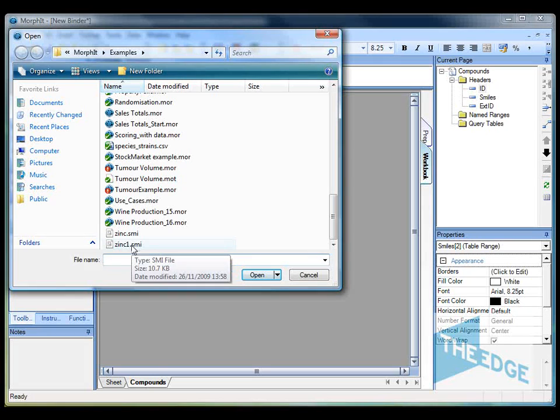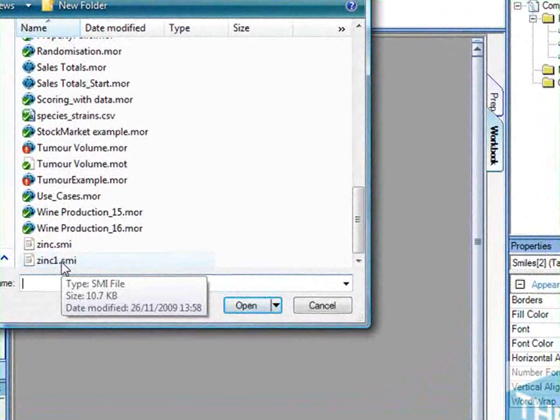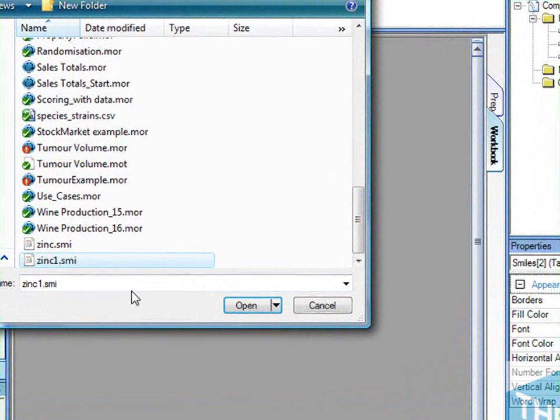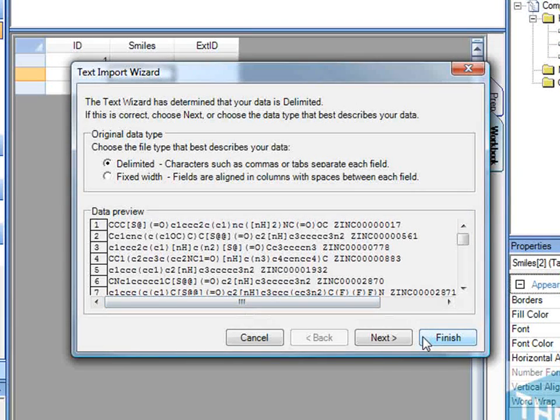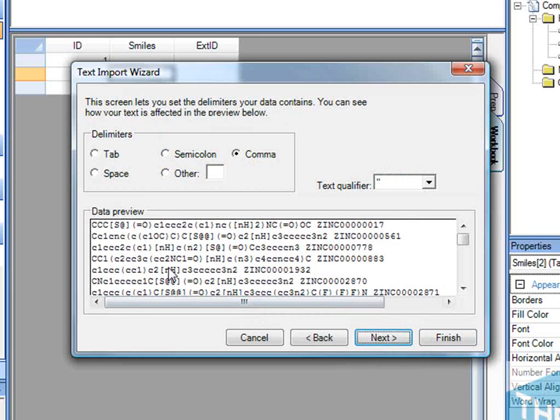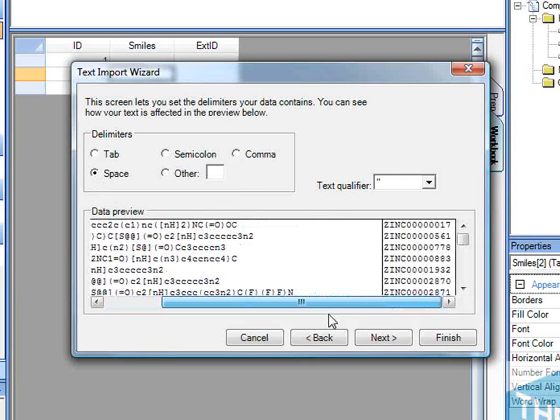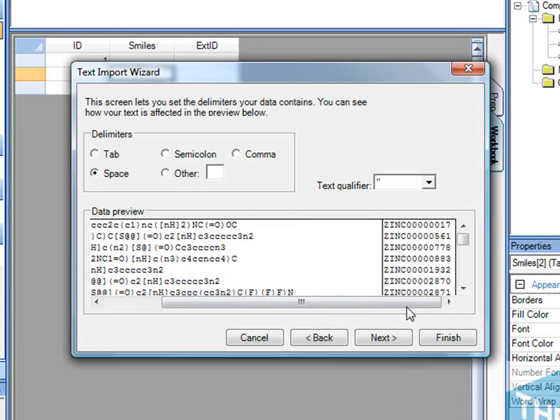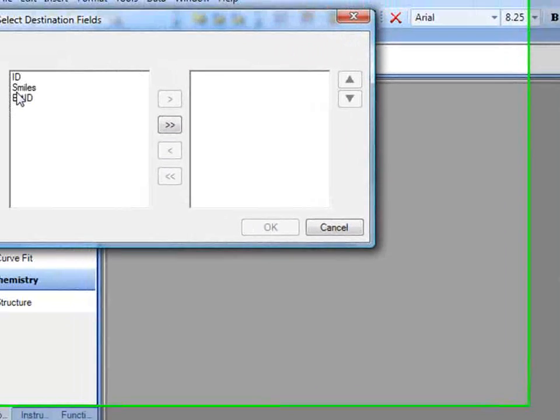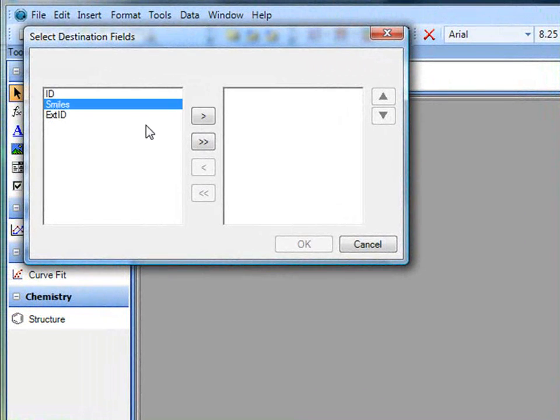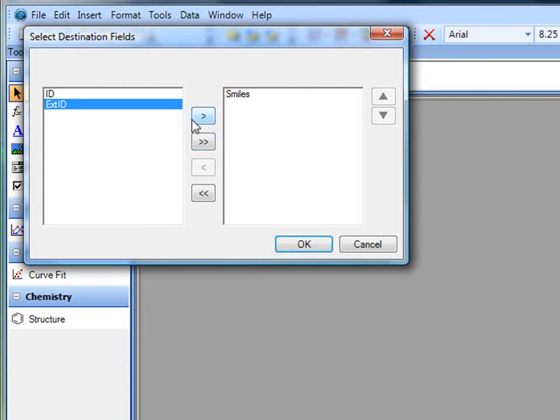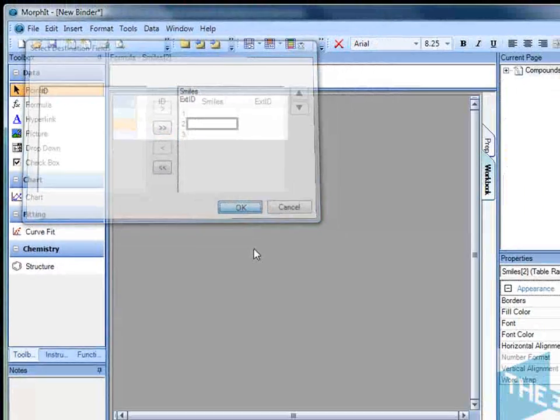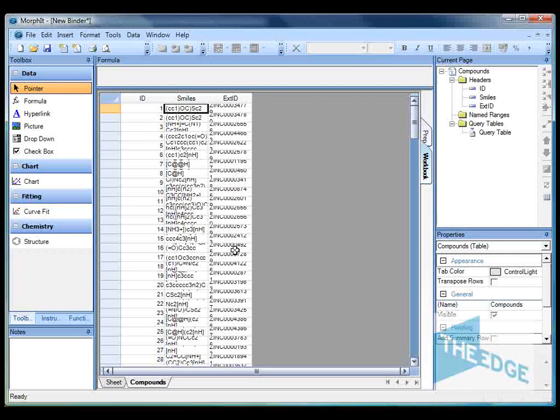This file contains smiles codes and also external identifiers from the Zinc database. So I open my file, move along. In this case it's a space-delimited file. So we can see it's separated the two fields. And I'm going to import the smiles column first of all and then the external identifier. That will go ahead and import this into the current table.